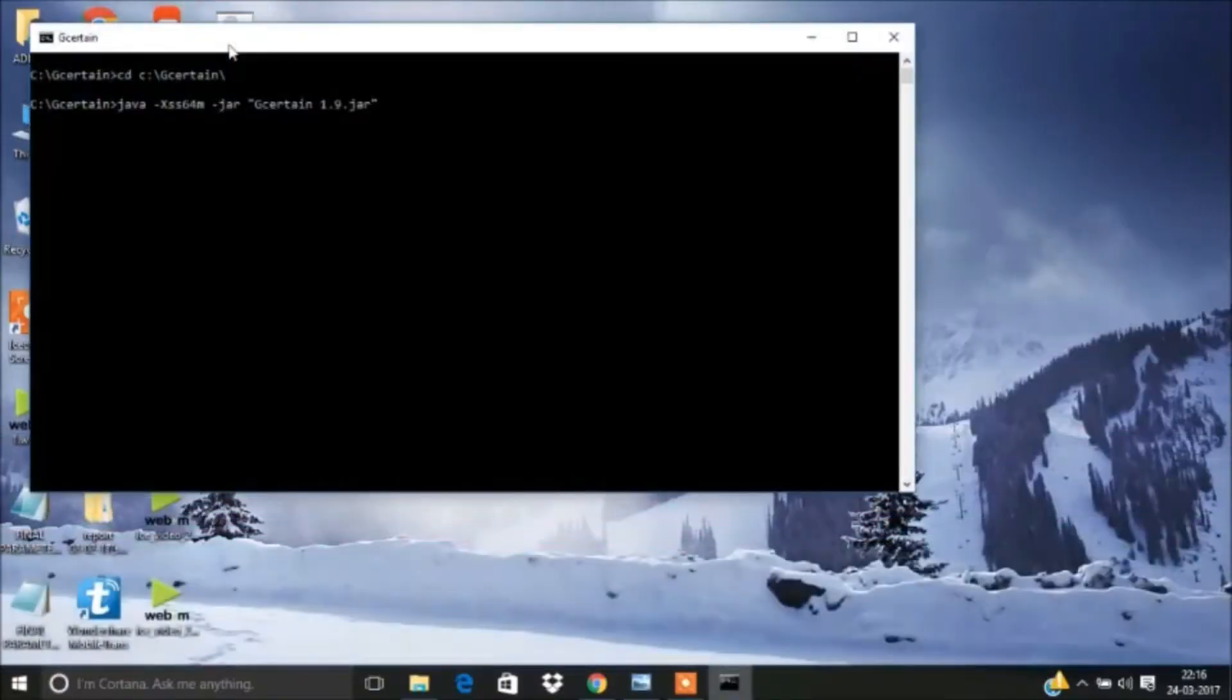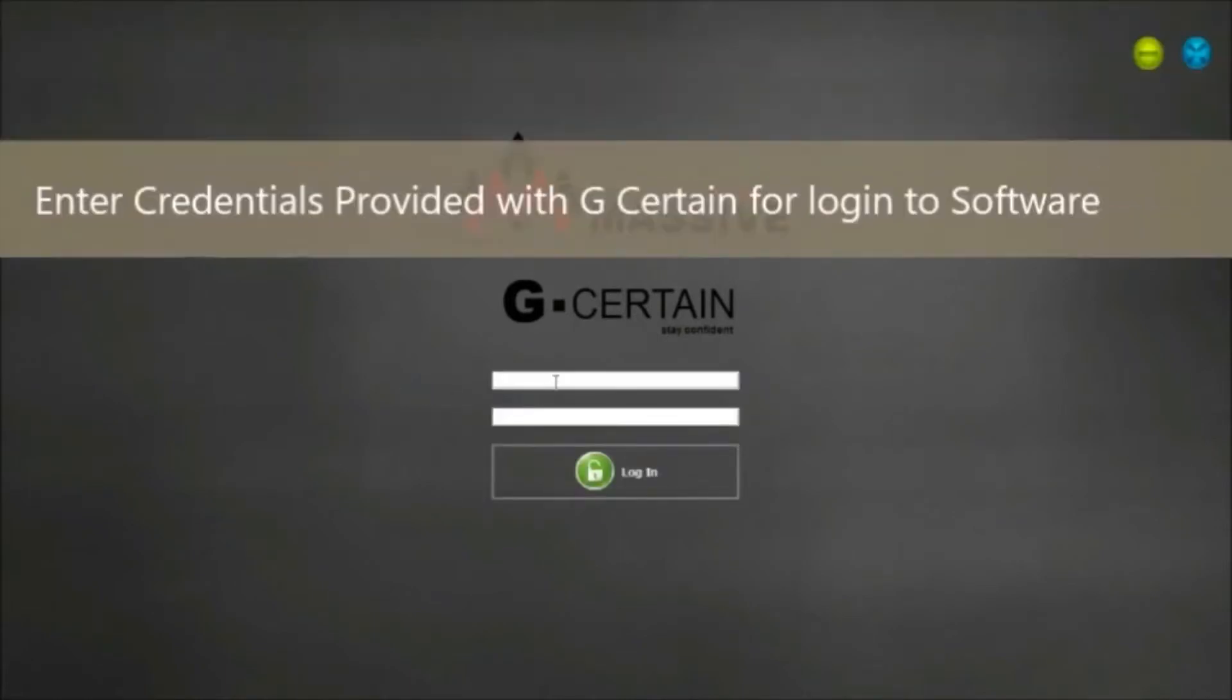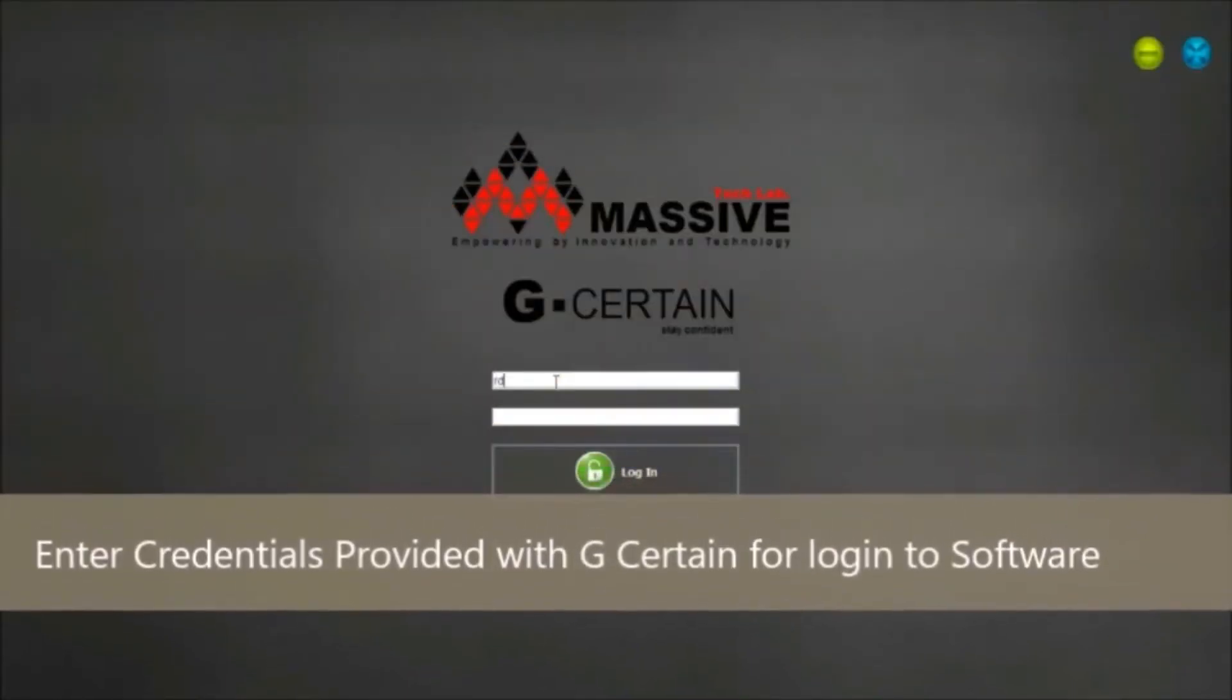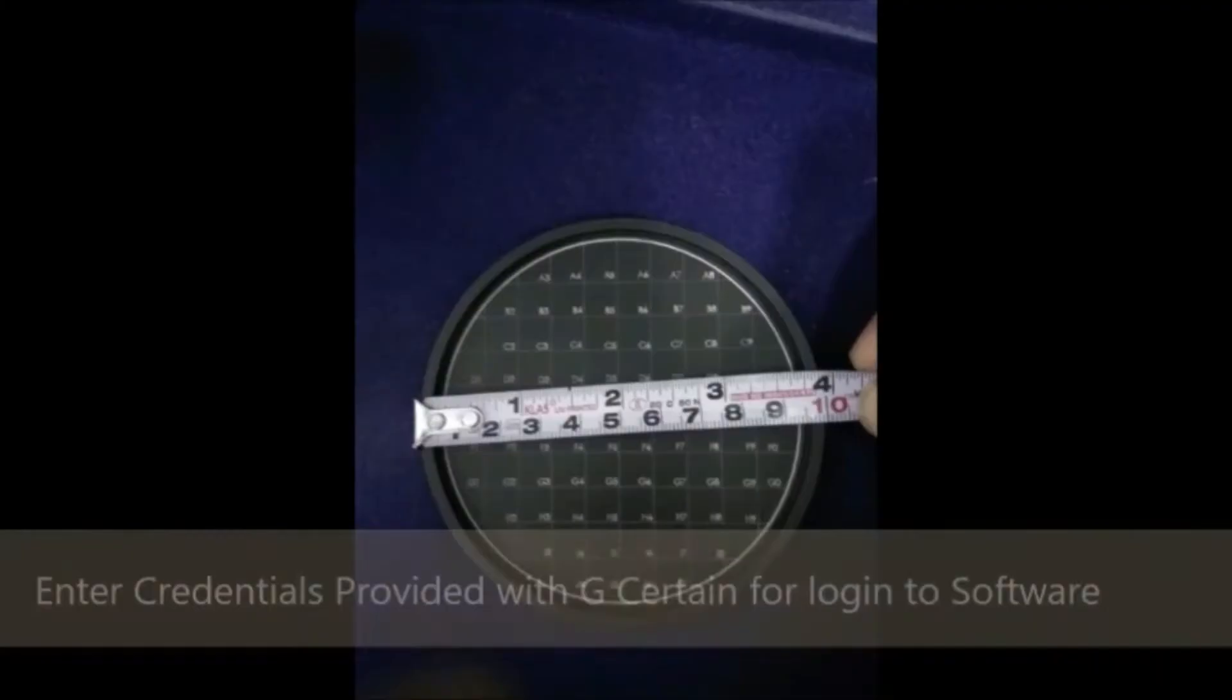After waiting a few seconds, please enter credentials provided with G Certain and log into the software.